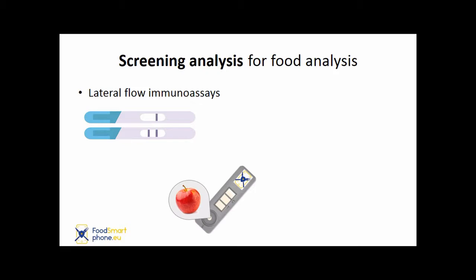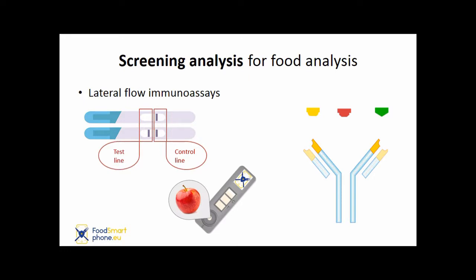A lateral flow immunoassay consists of a control line that shows whether the test is performed correctly or not, and a test line that shows whether the test is positive or negative. Both lines have antibodies on them. An antibody produces a signal when a specific substance is in the sample, and they don't when other substances are there. However, if a substance of the same physicochemical characteristics is in the sample, it might also produce a signal.